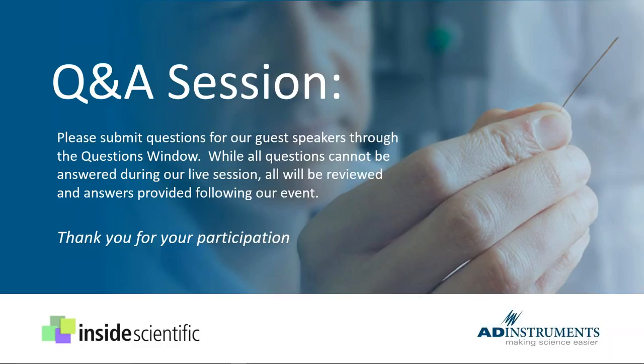This question I think you'd like to chime in on. Specifically, Sarah Roldan has asked, in a multi-segment catheter with 10 electrodes in which she needs to block some of the electrodes since they don't all fit inside the ventricle, should she block the first electrodes in the catheter or the last electrodes of the catheter or both? What's the prescribed best practice here for when you're dealing with a multi-segment catheter?